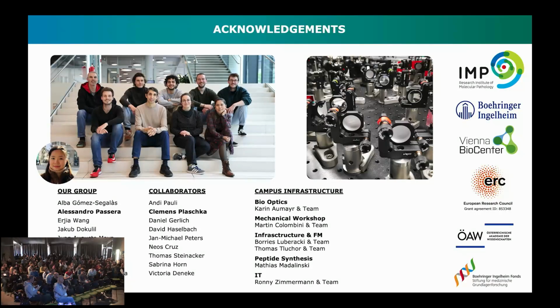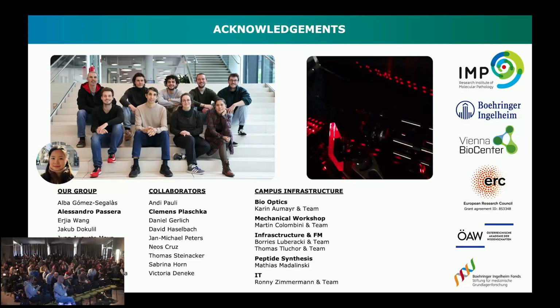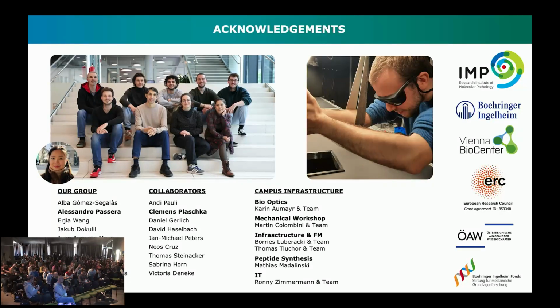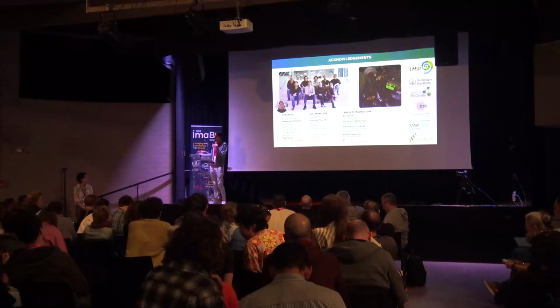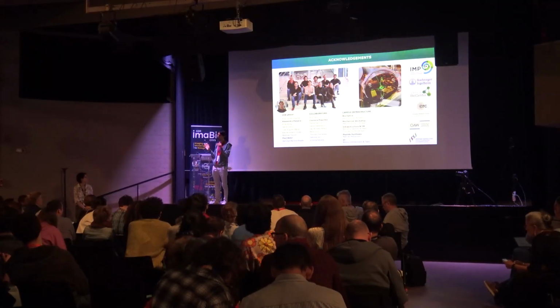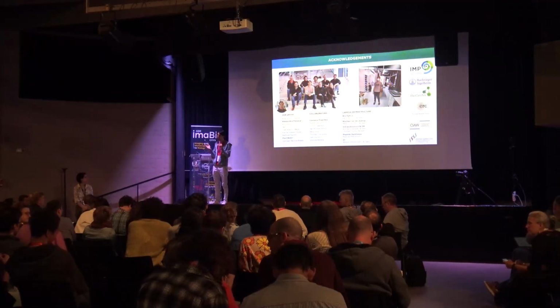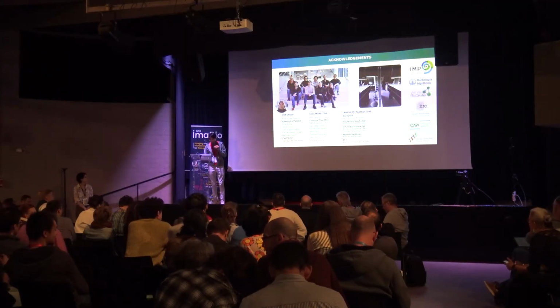So this is cohesin. We're putting cohesin with or without NIPBL, with or without ATP, and with or without DNA. We have cohesin with 5 orthogonal sites that we can label modularly. What I showed is just 2 of them.